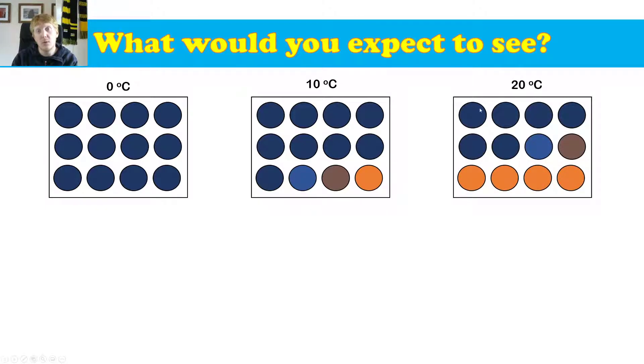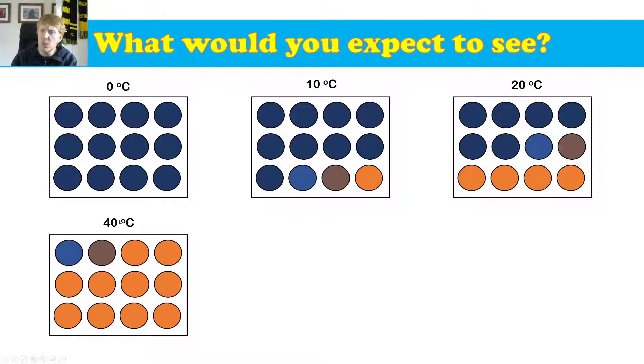At 20 degrees, it's a little bit warmer still. So the enzyme works a little bit better and it breaks the starch down a little bit earlier here. At 40 degrees, perfect temperature. It breaks the starch down really quickly. You can see by like the third tile, we already have broken down the starch. So after 60 seconds, we've basically broken down the whole lot.